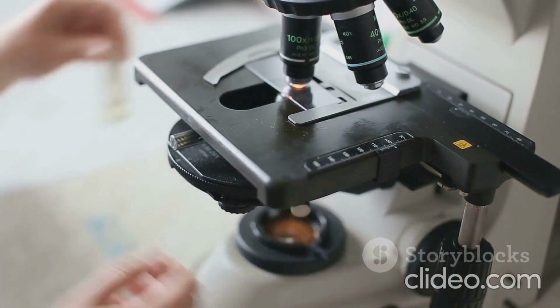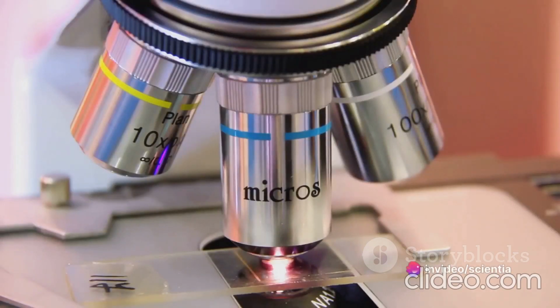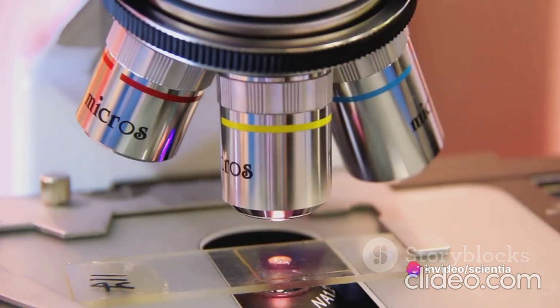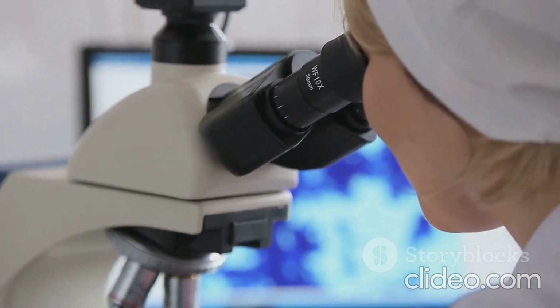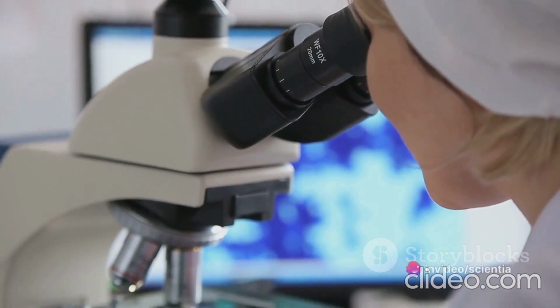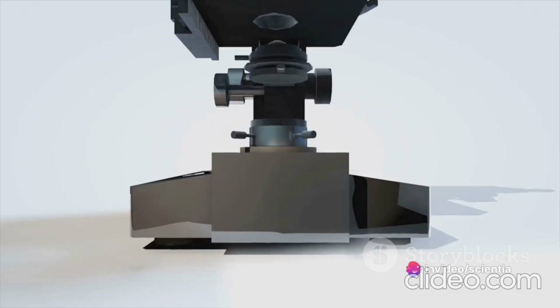Following the light microscope, the compound microscope made its debut. This advancement, which came about in the 17th century, features two sets of lenses for greater magnification, the objective lens and the eyepiece. This type of microscope has been a game changer in the field of histopathology, enabling the detailed examination of thin slices of tissue to identify diseases.